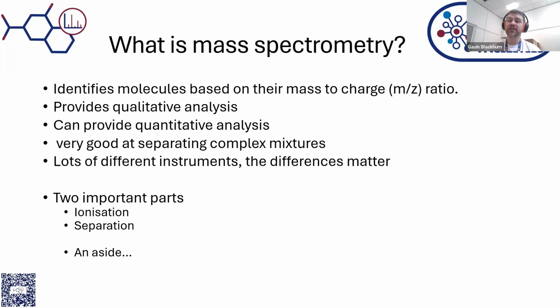And when you put them together in a different way, that can change the function of those molecules massively. And when you change the function of those molecules, they do something different in the biology. And to the mass spectrometer, initially, they might look exactly the same. So we have to use methods to be able to determine which of these different, we use the term isomers, which of these different isomers are present.